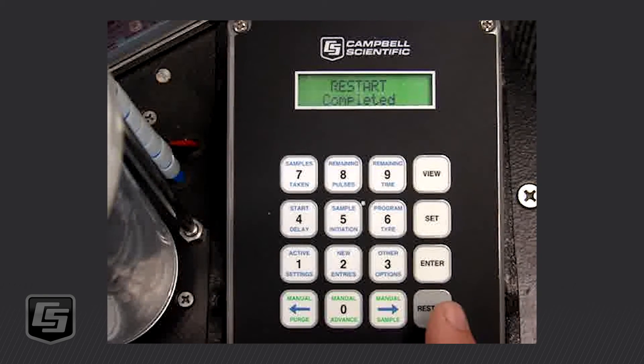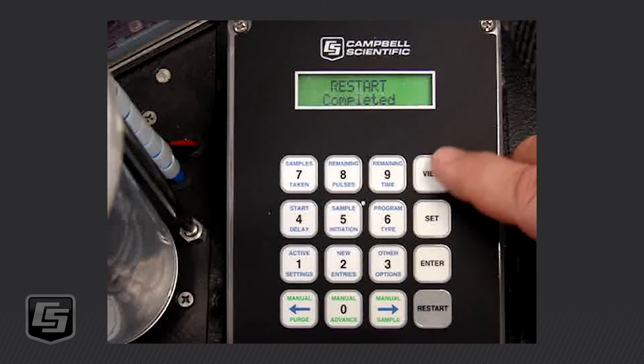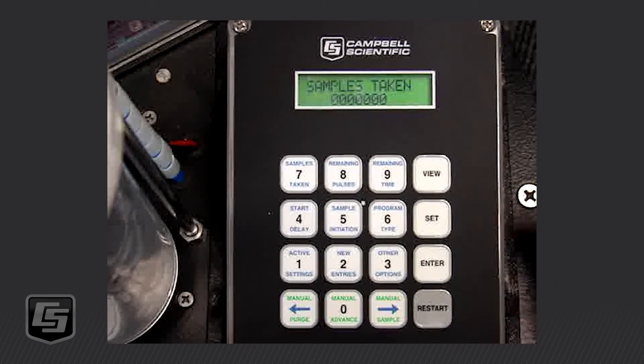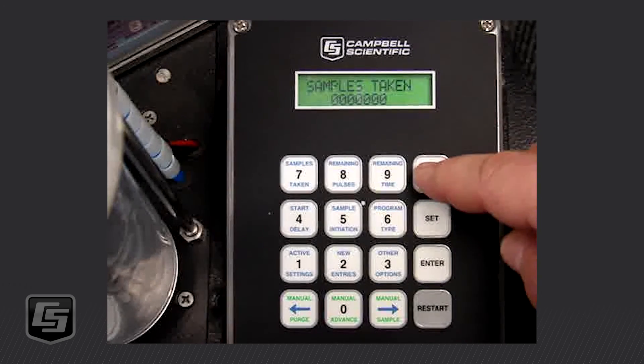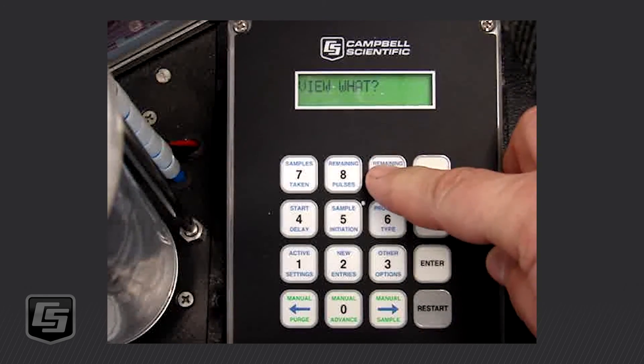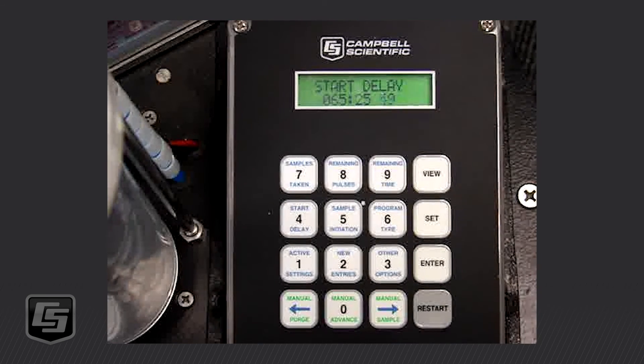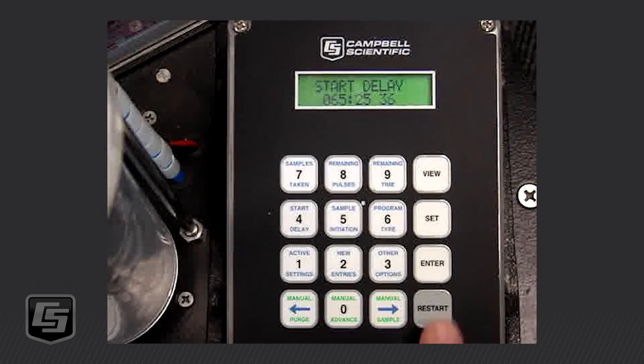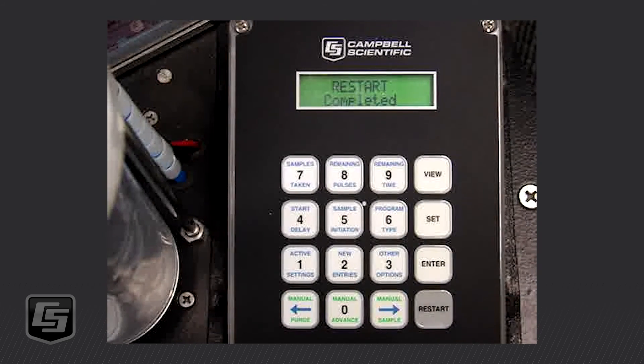At some point while it's running, if you want to know how many samples it's taken, you can push View Samples Taken — right now it says zero. If we want to see the remaining time before it starts, it says we've got 65 hours, 25 minutes, and 49 seconds counting down, which would be Monday morning. If you want to go back to the main window, you'd push the Restart button, but be aware that will reset the sampler and start over. It is now restarted and ready to begin sampling Monday morning.